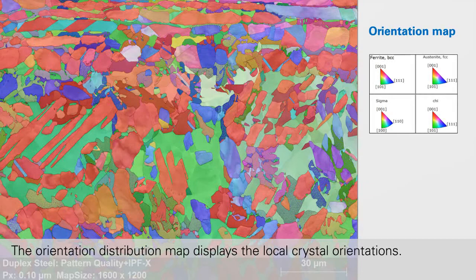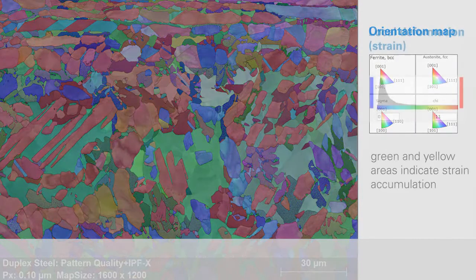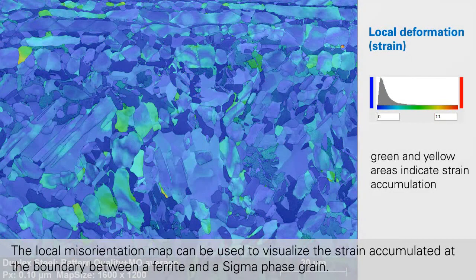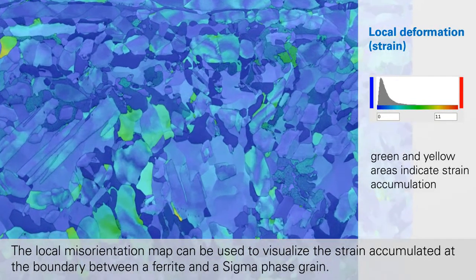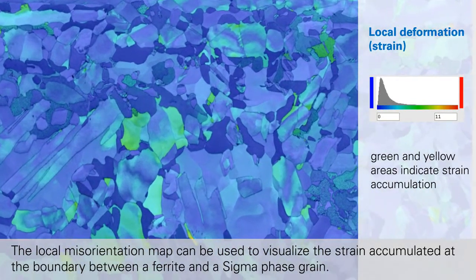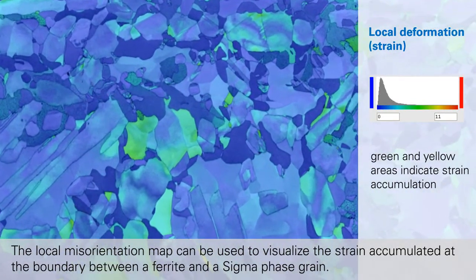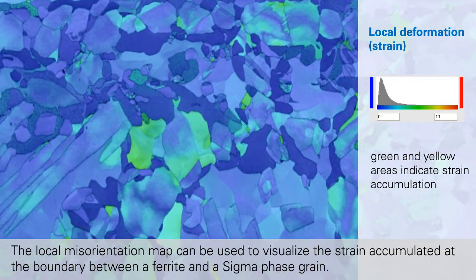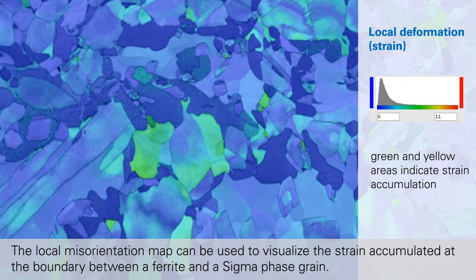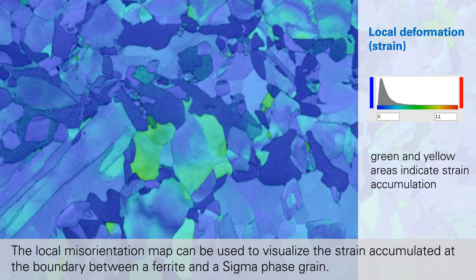The local misorientation map can be used to visualize the strain accumulated at the boundary between a ferrite and a sigma phase grain. In this example, the green and yellow areas indicate the strain accumulation.